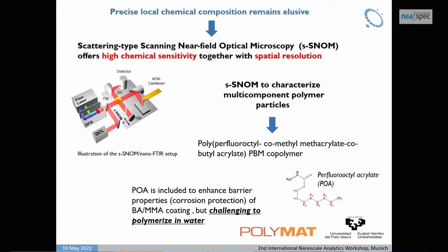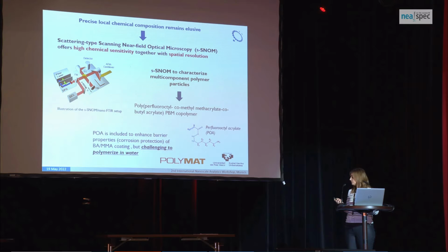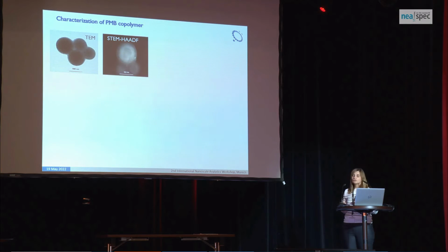So the polymerization of this system was done by our collaborators from the Polymer Institute, Materials Institute of the University of the Basque Country. And as a result, we obtained these particles. This is the TEM image. You can see that they look quite homogeneous.